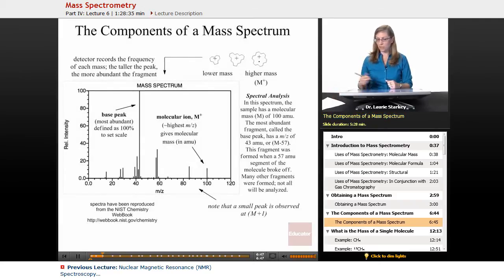So let's take a look at an example of a mass spectrum. This is what a mass spectrum looks like. So down on the x-axis, we have our mass to charge ratio. So again, remembering our charge is usually plus one, we're showing the various masses of the different fragments. And over on the y-axis, we have the relative intensity. This is the abundance. So what we're seeing here is a histogram, how many of each mass was recorded, was formed in the mass spec, and then recorded in the spectrum. So these various charged fragments, remember everything we see in a mass spec represents a charged ion, a plus one. These are going to hit the detector, records the frequency of each mass, and therefore the taller the peak, the larger the signal, that means you have a more abundant fragment.